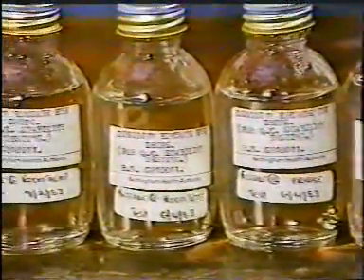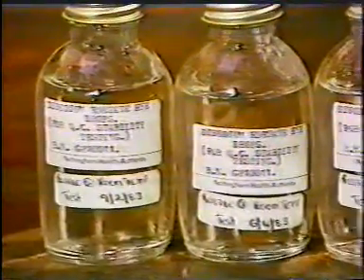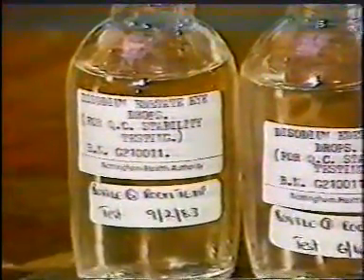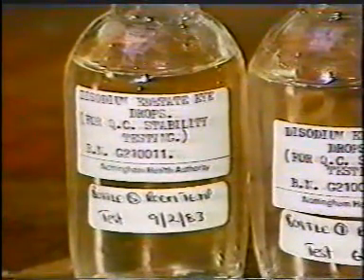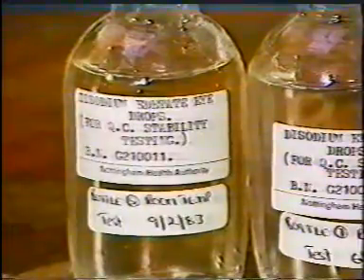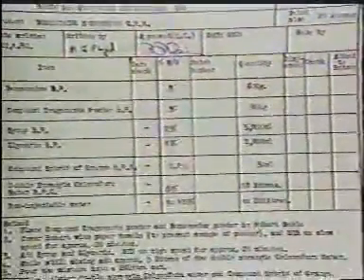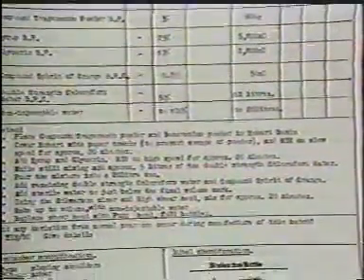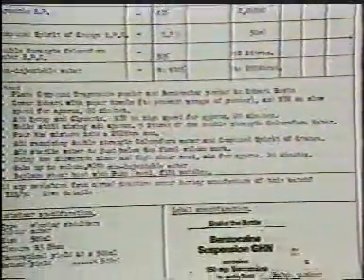Clearly, a variety of factors must be taken into account when new products are being developed, and the production unit will need to prepare trial batches so that chemical and microbiological stability studies can be carried out by the quality control section. Once a satisfactory formulation has been achieved, a master batch sheet is prepared by the production section and approved by quality control. Photocopies are used as batch sheets for individual batches.